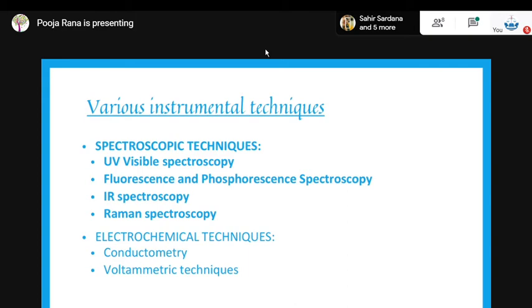All right. Luminescence is when some material produces energy of itself, and it falls in that particular spectrum, so that it is radiating out that energy in the form of light which is visible to our eyes.